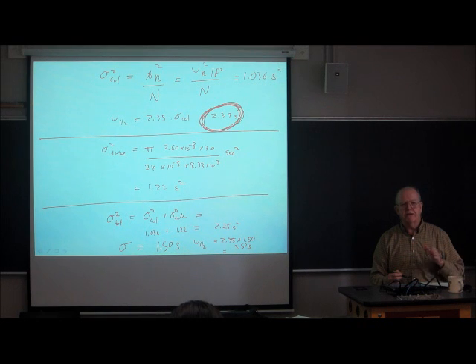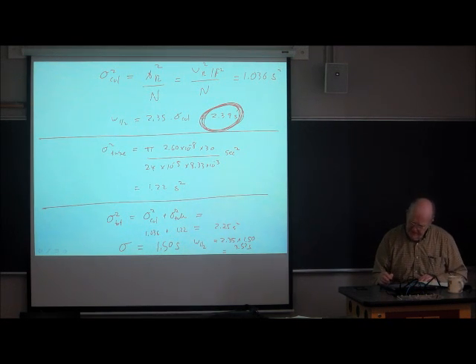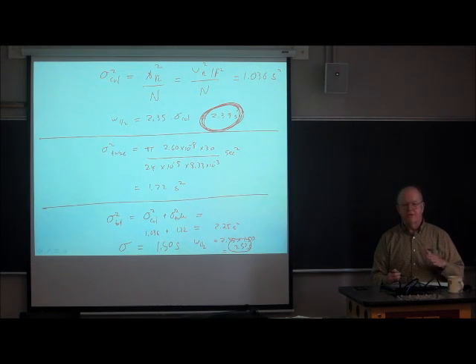Unfortunately, you do have to connect the column to an injector and a detector. And that's going to approximately increase the peak width by 50%. You are going to take a very, very serious hit in the appearance of that peak. It's going to be much wider than it really is. It's going to appear to be much wider than what it really is at the exit of the column.